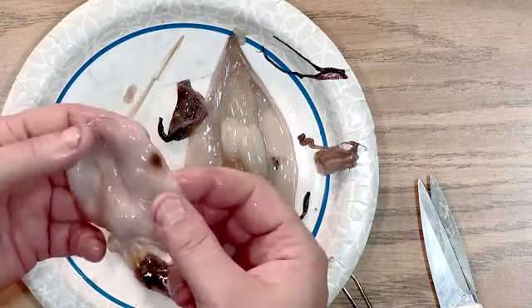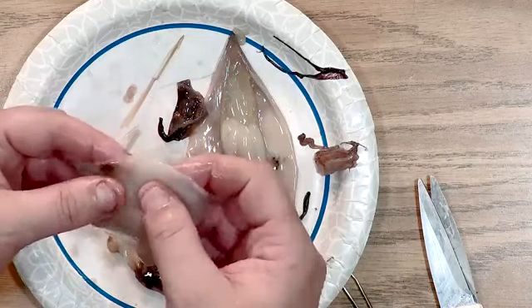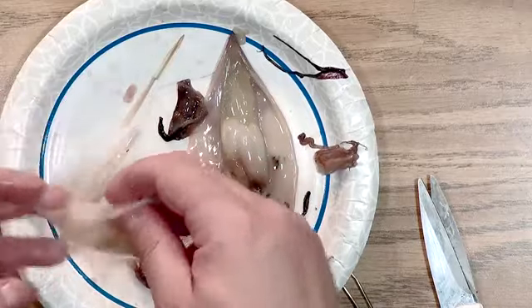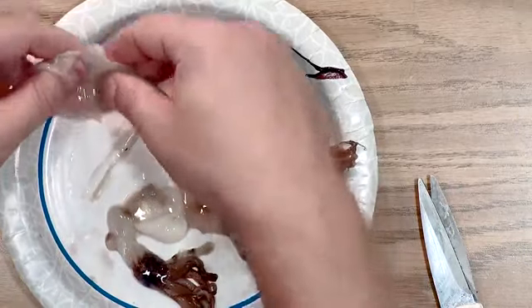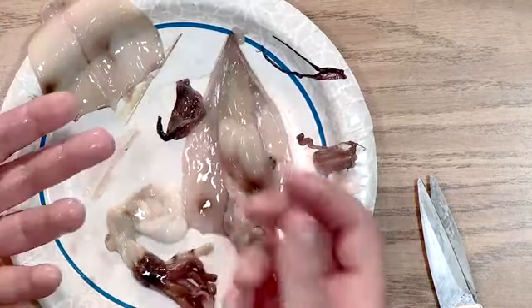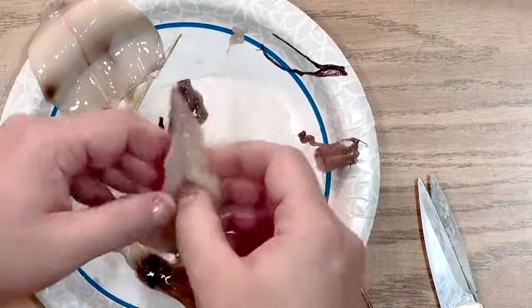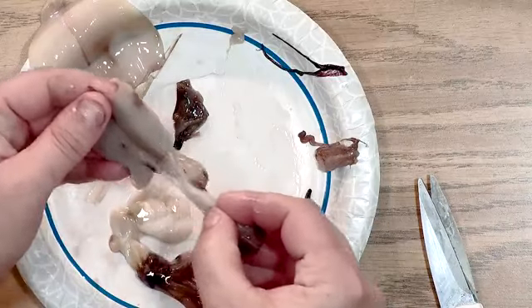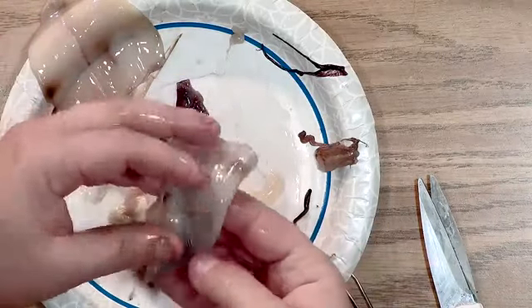Now I still want to wash this, and I got a little discolored piece here. I would probably trim this off just because I'm not sure exactly why that's there, whether it's some type of abnormality in that specific squid. But when dealing with the unknown, I probably don't want to eat it. You could look it up if you were curious. Now I'm going to do the same to this one and separate it.